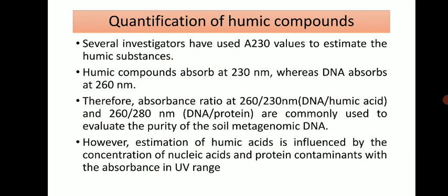For quantification of humic acid contamination, reports show absorbance at 230 nm is used to estimate humic substances, while DNA absorbs at 260 nm. Therefore, the absorbance ratio of 260 to 230 nm is the main criterion to identify any contamination caused by humic acid compounds — this is how we determine whether DNA is contaminated with humic acid.